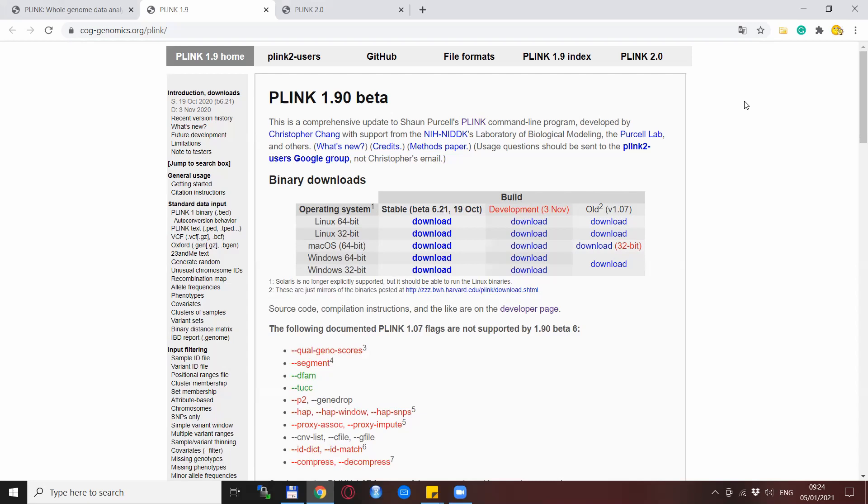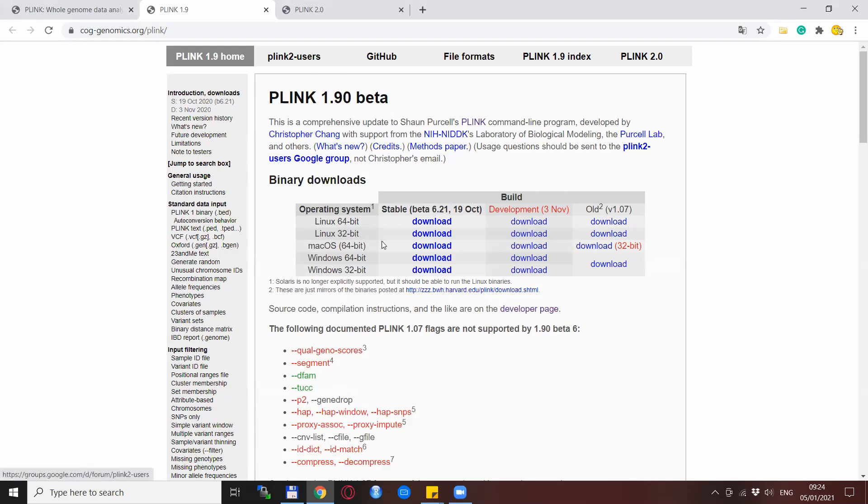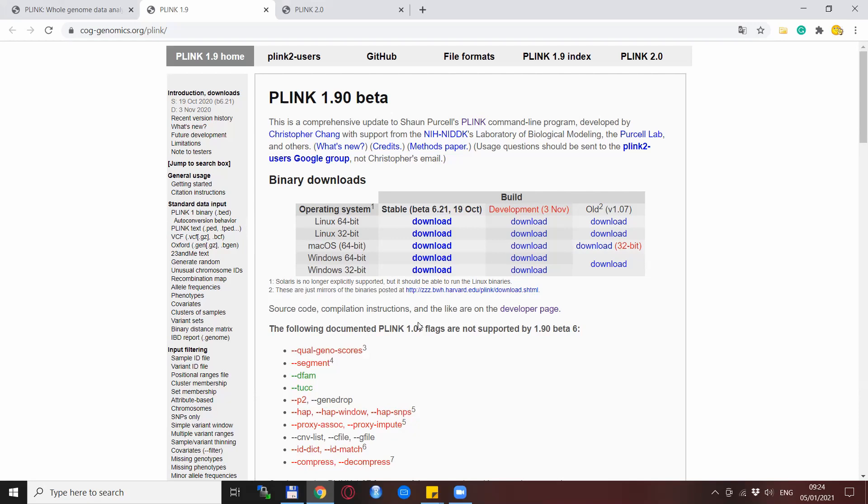So here we are on the Plink website where we get Plink from. There are multiple different versions of Plink as you might have noticed but don't worry about it just now, I will tell something about it at the end of this video. For now go for the Plink 1.9 website where you find the download section. Click the appropriate download button, of course considering your operating system, because if you download Plink for a different operating system it will not work.